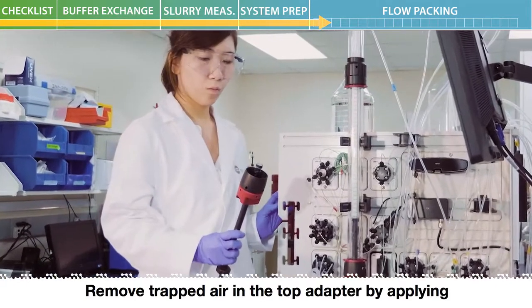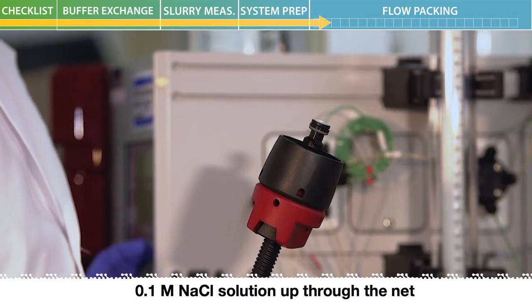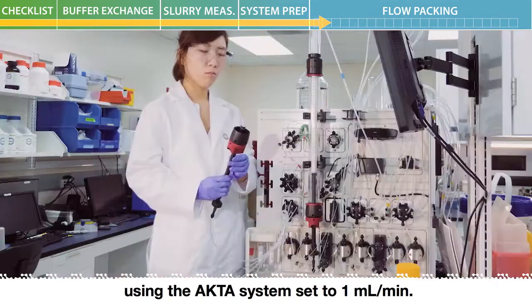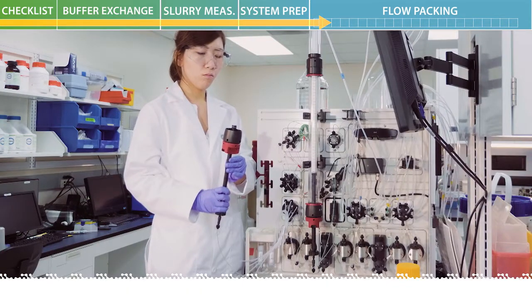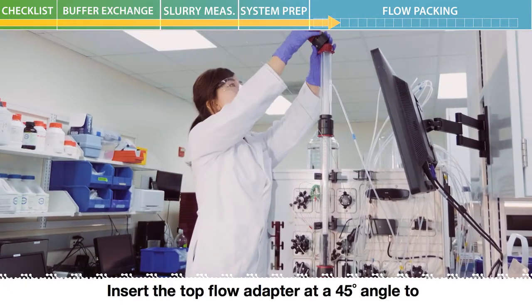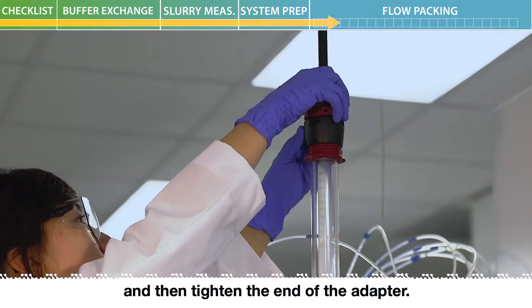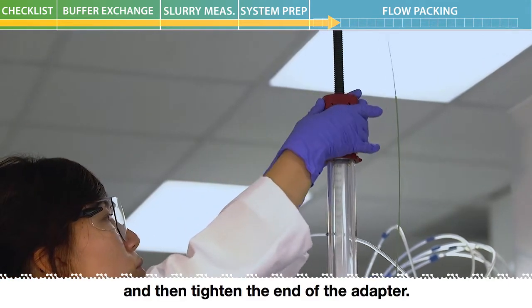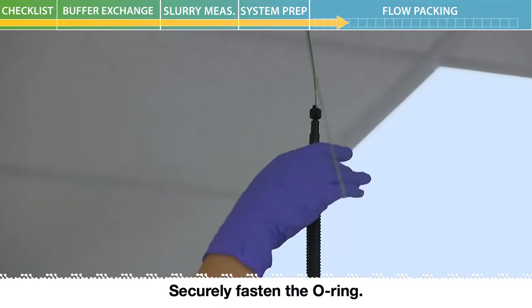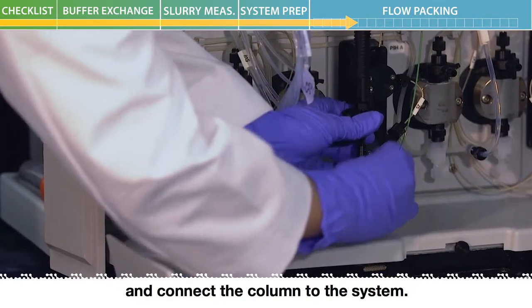Remove trapped air in the top adapter by applying 0.1 molar sodium chloride solution up through the net using the ACTA system set to 1 milliliter per minute. Insert the top flow adapter at a 45 degree angle to prevent air from getting inside the column, and then tighten the end of the adapter. Securely fasten the O-ring. Remove the stop plug at the bottom adapter and connect the column to the system.